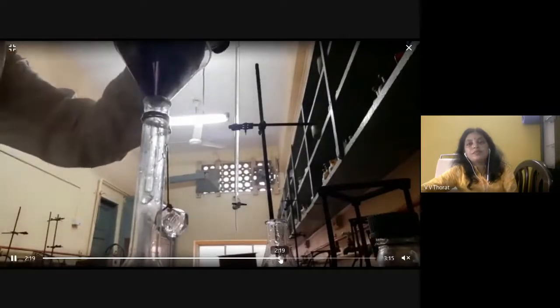He will show you how to transfer in the second half. You will transfer by using a glass rod. Where is my camera? Now you will be able to see. While transferring, very, very important, you will use a glass rod. This is what I wanted to show you.